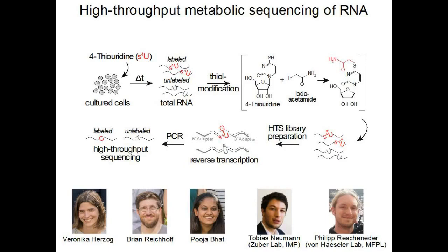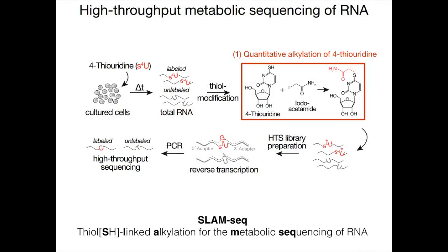Now, I would like to use the next couple of slides to guide you through the key steps of the SLAM-seq protocol and the experiments we have performed to validate the chemistry and the nucleotide conversion readout. I will then introduce you briefly to the library preparation methods we are employing and the important technical considerations that need to be taken into account when starting a SLAM-seq experiment. And in the end, I would like to show you briefly how we employ SLAM-seq in mouse embryonic stem cells to get insights into the regulation of pluripotency-associated gene expression at the transcriptional and post-transcriptional level. Now, first, we have to validate the key steps of the SLAM-seq protocol in order to ensure that this is a highly quantitative method.